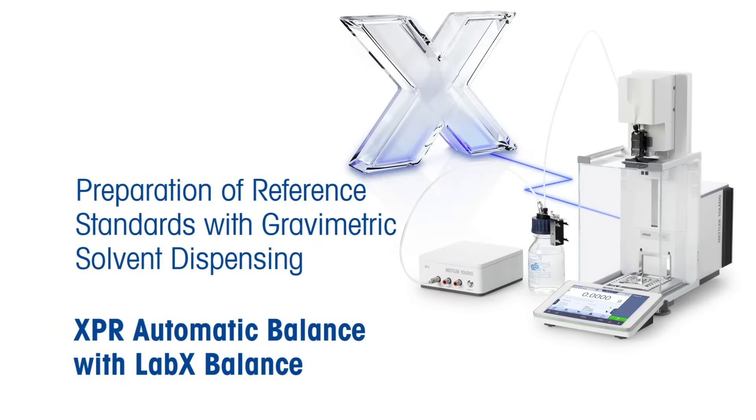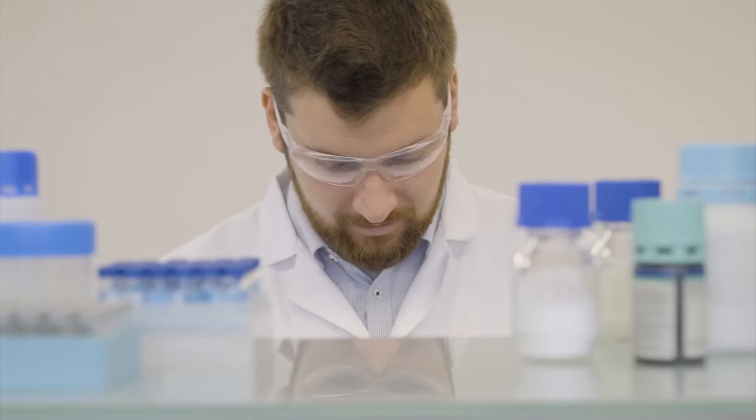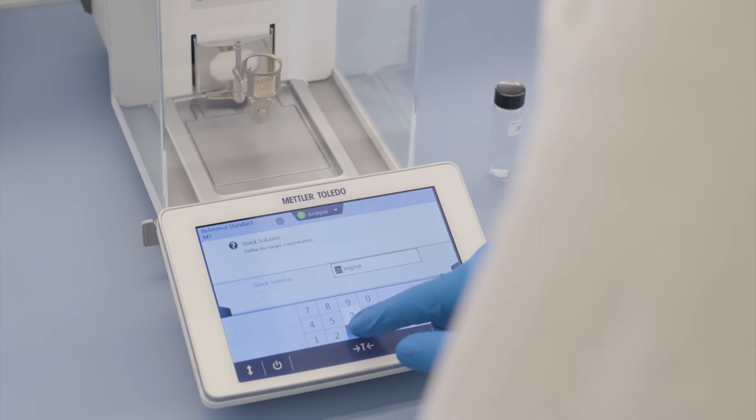Mettler Toledo's liquid dispensing module makes it possible to prepare highly accurate solutions. Simply select the required method from the home screen and follow the step-by-step instructions.